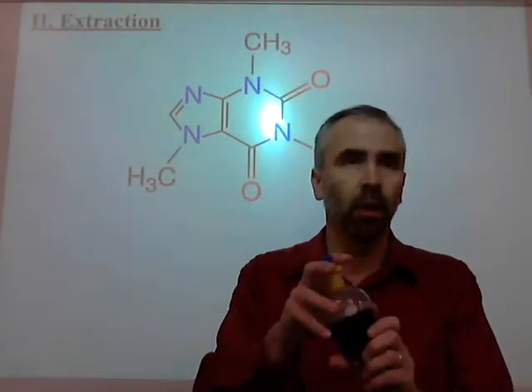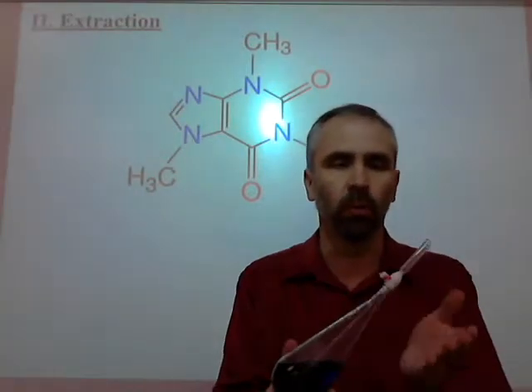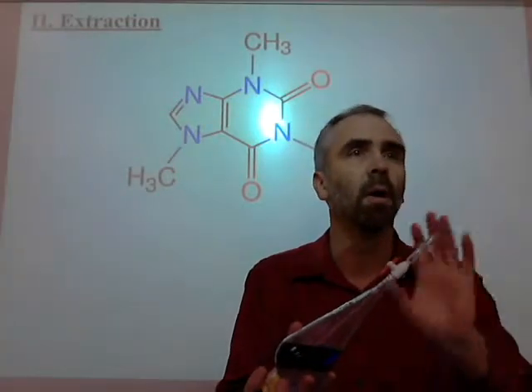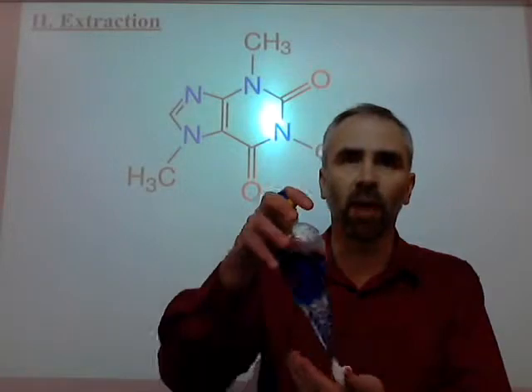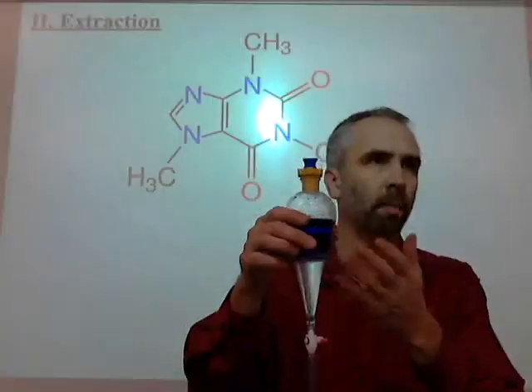Okay, and then you're going to turn that upside down, and as soon as you add these together in the fume hood, you're going to tap it so there's no stuff here, and then vent it, and you'll hear a little pop, a little pressure being released. All right, and then if you shake it up, no matter how much I shake this right now, that blue's always going to come back to the top. All right, you just have to trust me. I don't want to get a whole lot of bubbles in there.